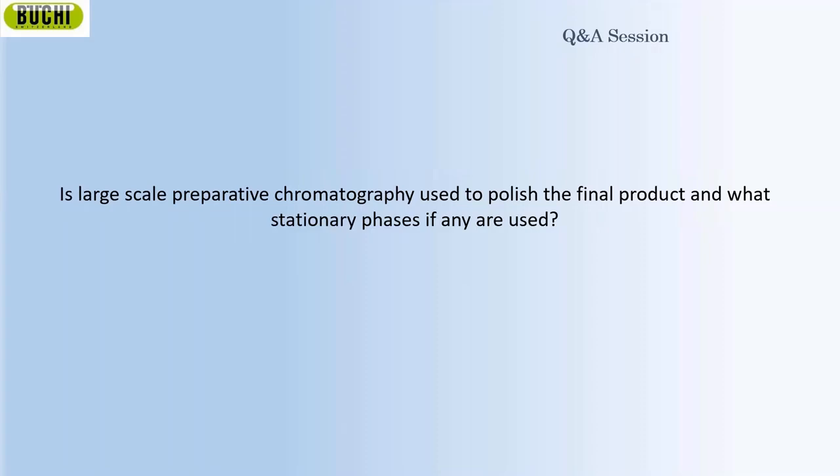Okay, that's great. So this is also what we mentioned. In chromatography, in flash systems, you can have normal phase and reverse phase. We determine whether we should go for normal or reverse phase depending on the polarity of our product. In this case, we have to go for the reverse phase. When we go for the reverse phase, we use C18 as a stationary phase, and we use ethanol and water as a mobile phase. So the answer to this question is C18 as a stationary phase. However, if we use normal phase like silica, I do not believe the separation is good, and your results will not be good because of the solvent that we use.